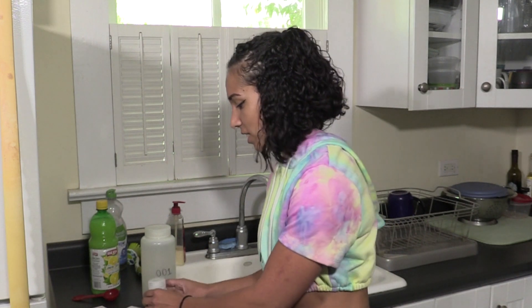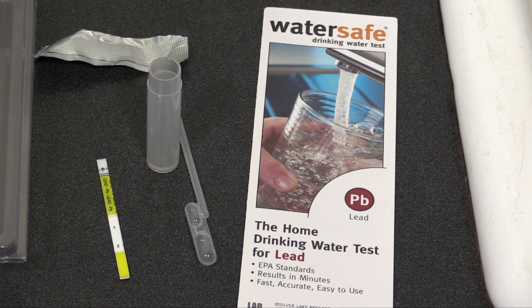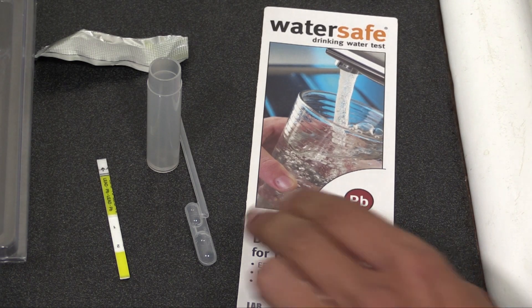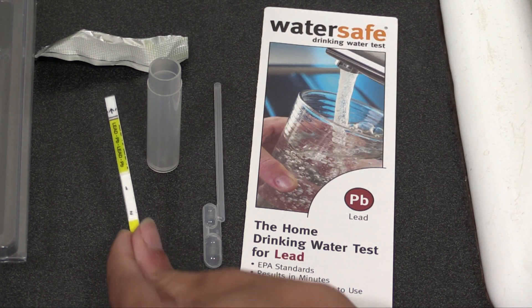They'll be shipped to the lab for further testing. Now, finally, you can open your water-safe lead test. Inside, you'll find the instructions, a dropper, a small test tube, and the test strip.